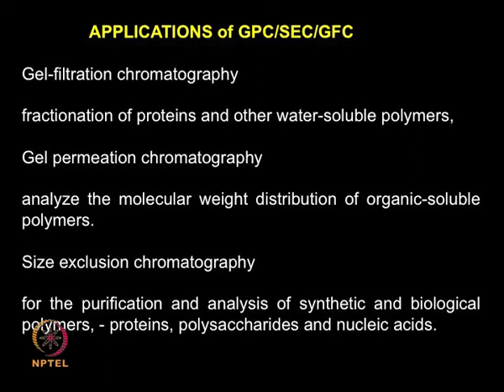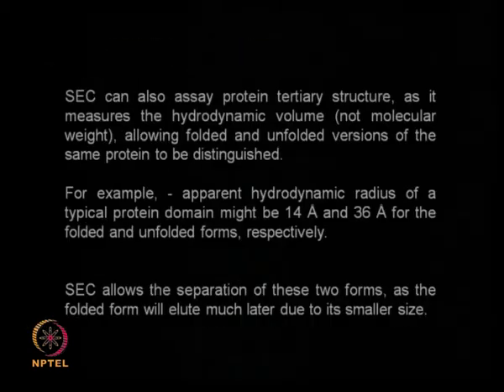That is why it is extremely popular, these GPC or SEC or GFC, and it finds application everywhere in protein purification, protein chemistry, in normal organic chemistry labs, in polymer chemistry lab, and in downstream processing lab and biochemical engineering lab and so on actually.